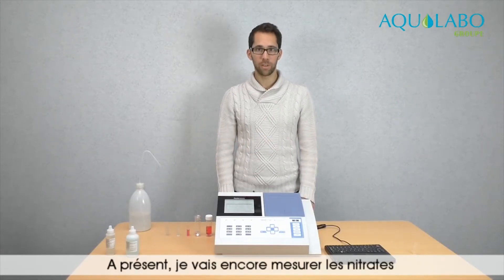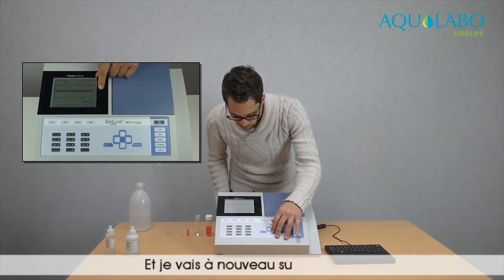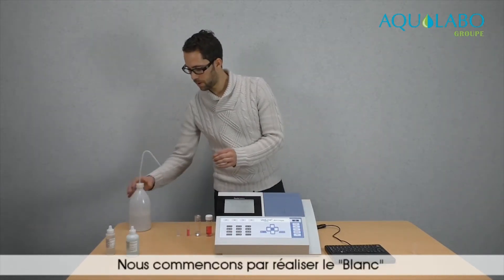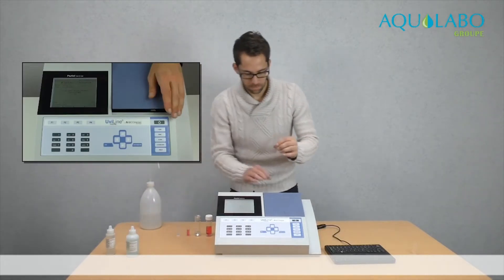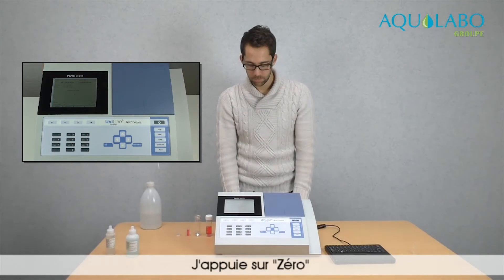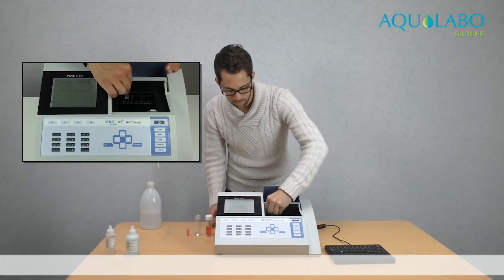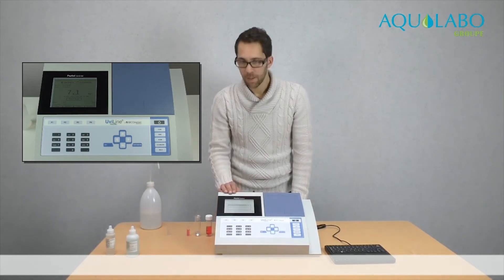Now I will measure nitrates again, but without reagents thanks to the UV method. So I go back to the list of methods and I go to nitrates again. I press start, and this time I choose spectralize. First, we have to make the blank with demineralized water. I press zero. I remove the cell, and then I put the sample without reagents, and I press start. And here is the result.